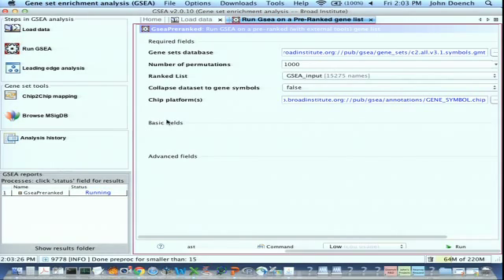That's okay. The number of permutations, right now it's set at 1,000. So it'll take a while to run. They recommend, and I should have in this demo, changing this number to 10 first, just to make sure that everything runs successfully. Then it'll only take a couple minutes to run. If it's running 1,000, then it'll actually take a little while. When you want to get your final analysis, you want to run through 1,000 permutations so that the statistics you get out at the end are meaningful.